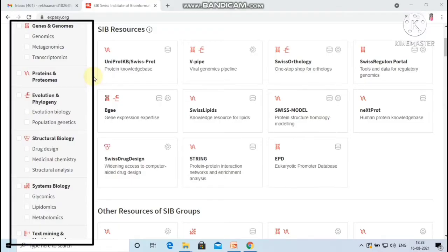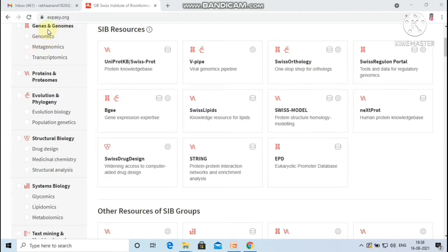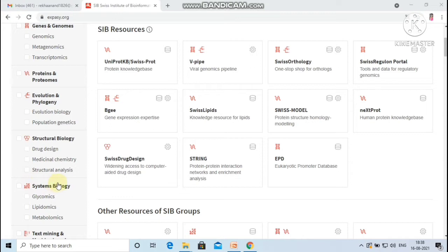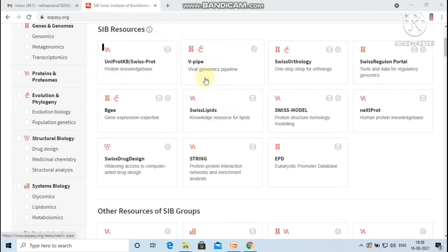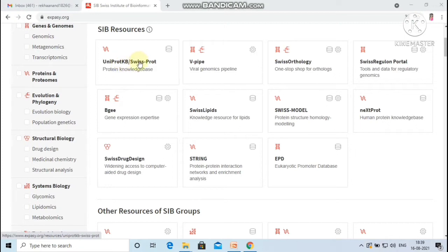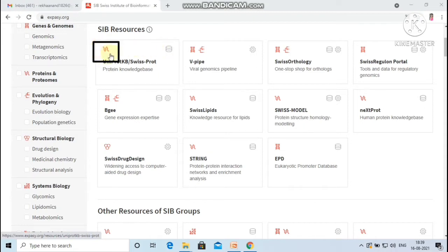There is a filter panel on left side of the page to filter resources by categories like genes and genomes, proteins and proteomes, evolution and phylogeny, structural biology, systems biology, text mining and machine learning, under which subcategories are also available. All the resources are listed as cards which are sorted randomly with resource name, short description, type, whether it is a database or a software tool or both, and to which categories the resources belong to.